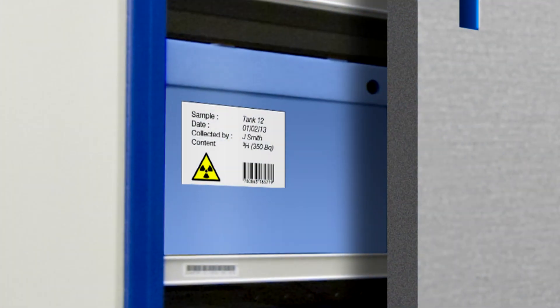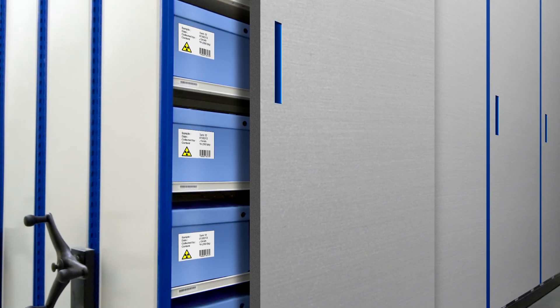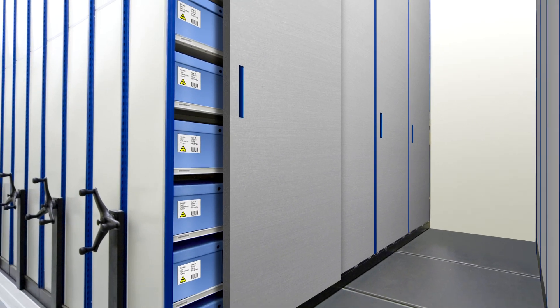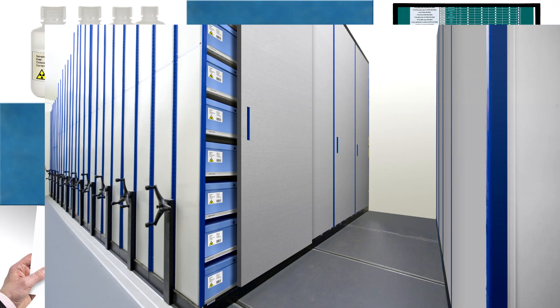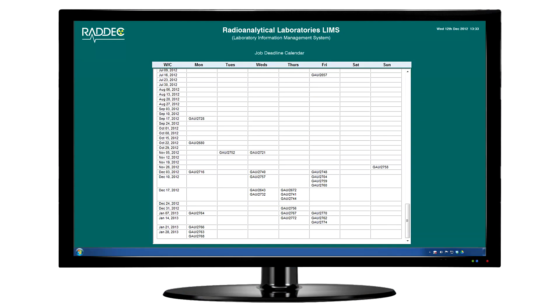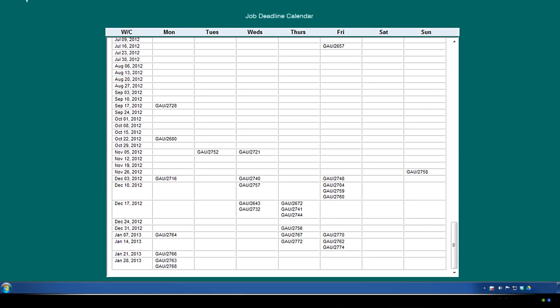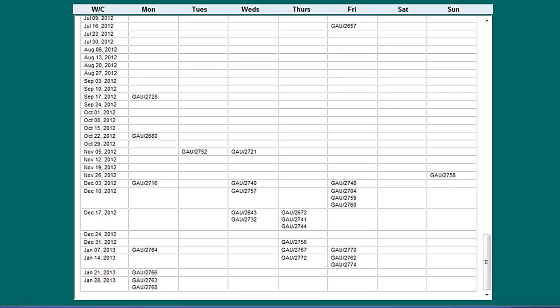Sample storage locations, archiving details and disposal data are included within the job records, allowing straightforward tracking of samples. RADEC LIMS utilises data entered during sample login to facilitate accurate analytical scheduling, for example by generating deadline calendars for each job.